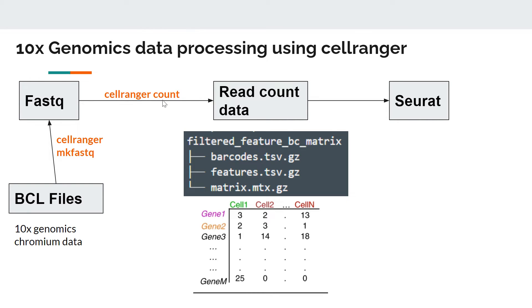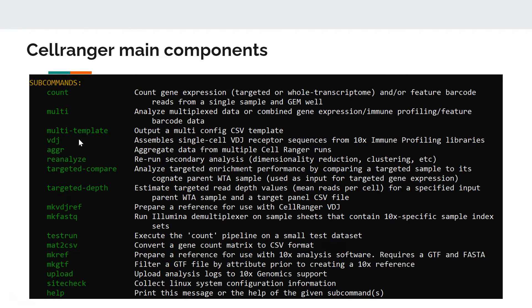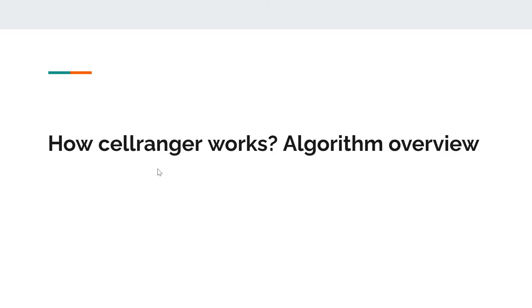In this video we will focus mainly on the count command, which converts FASTQ to read count data. Apart from mkfastq and count, there is one more command: aggregation. mkfastq is for BCL to FASTQ, count is for FASTQ to count for a single sample analysis, while aggregation is used to aggregate multiple count datasets. There are also other components like multi, but we will primarily focus on the count command.